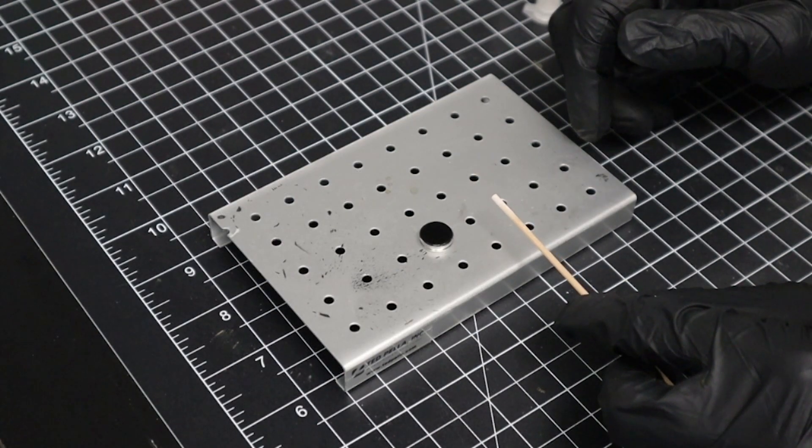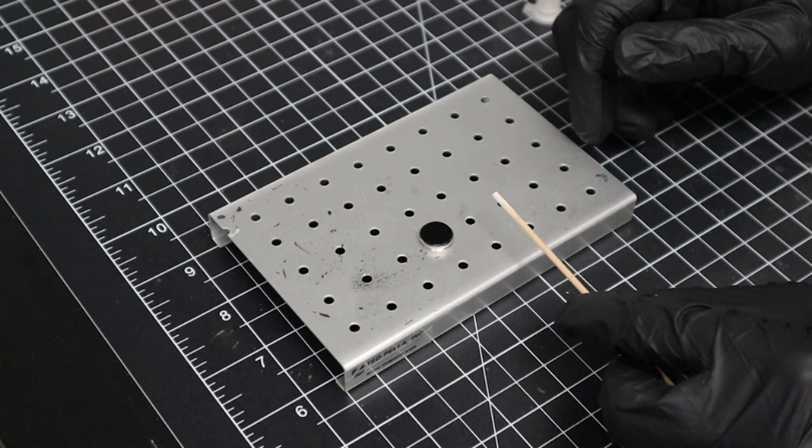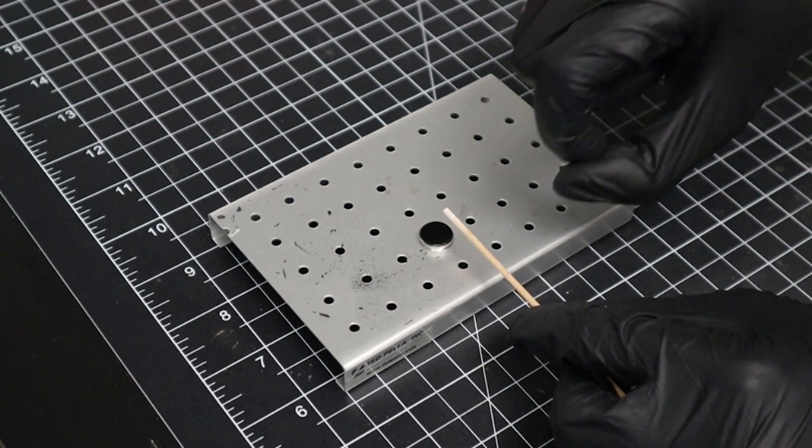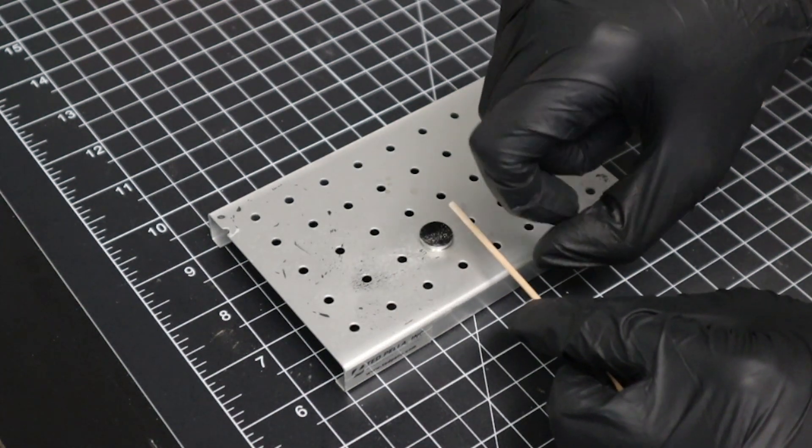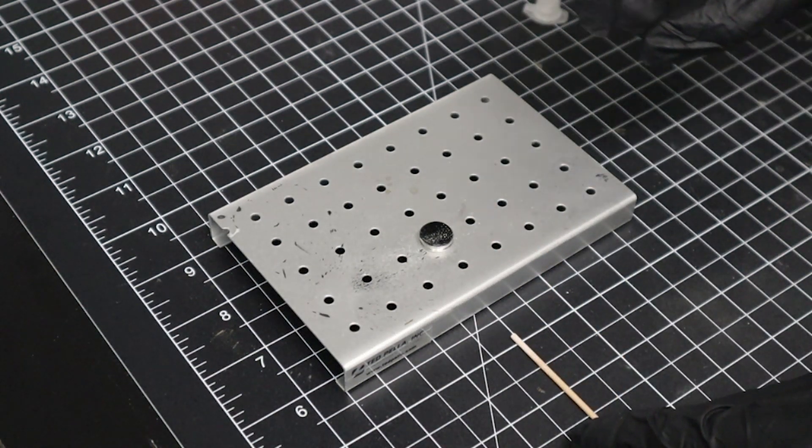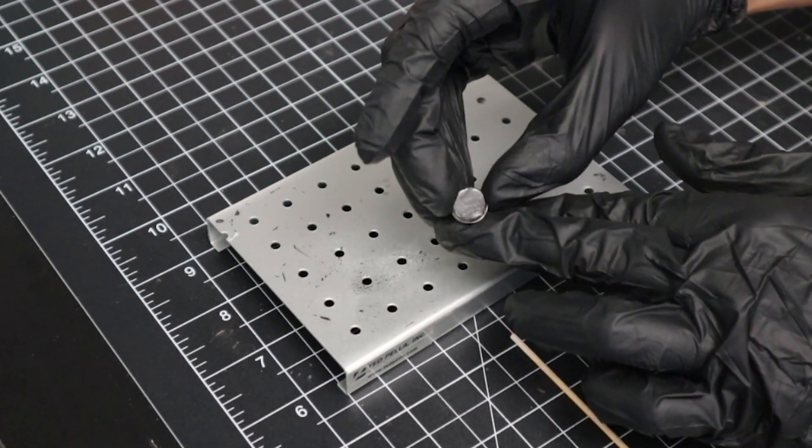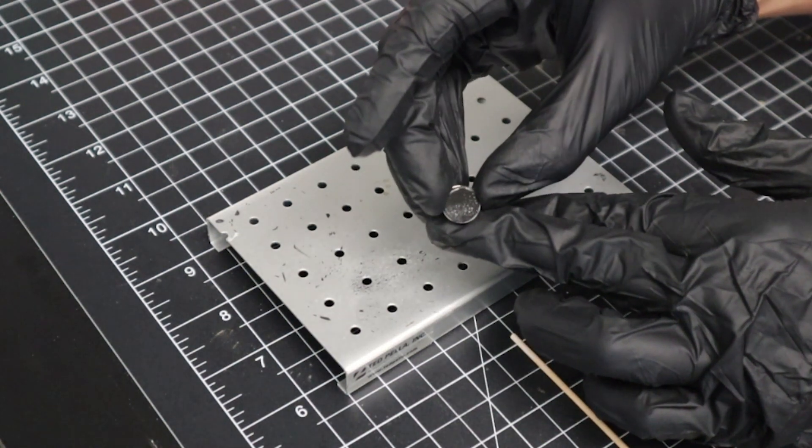Using our particle covered swab, we can then deposit the particles by hovering the swab over top of our sample stub, and then striking it with a quick flick. Applying such an abrupt force dislodges and aerosolizes the particles, resulting in an even distribution of particles on the stub.